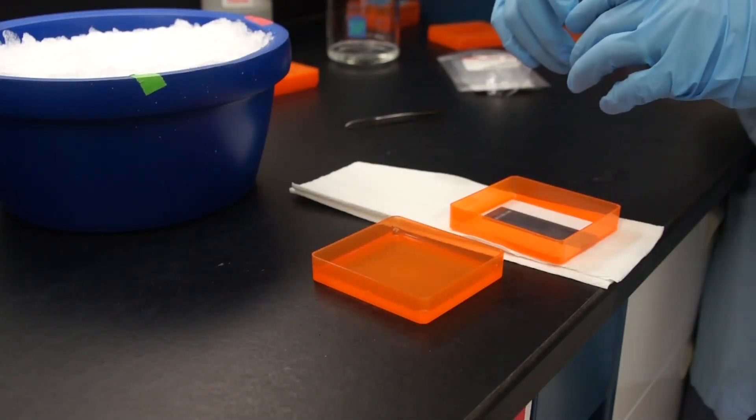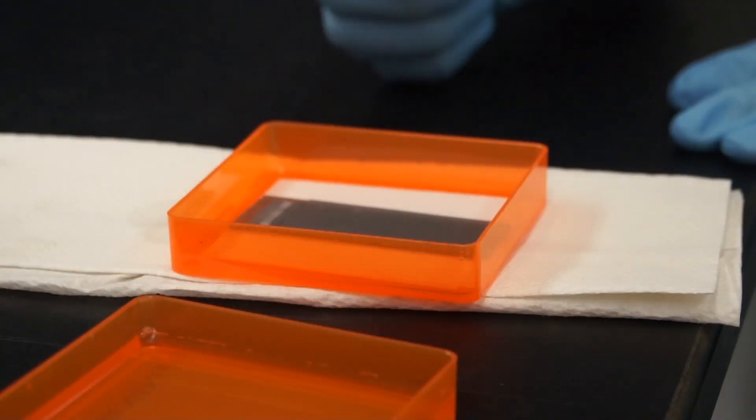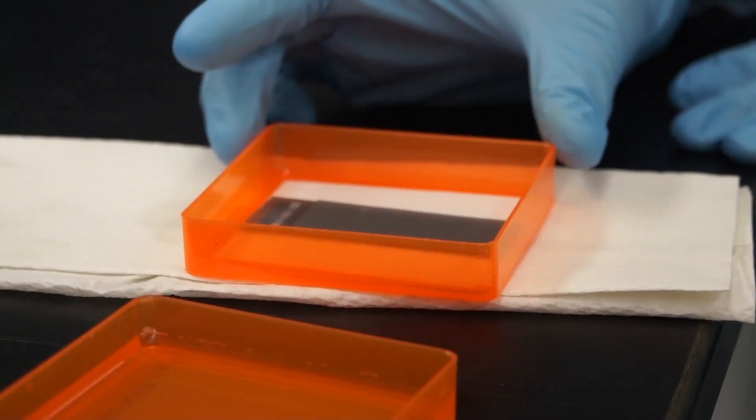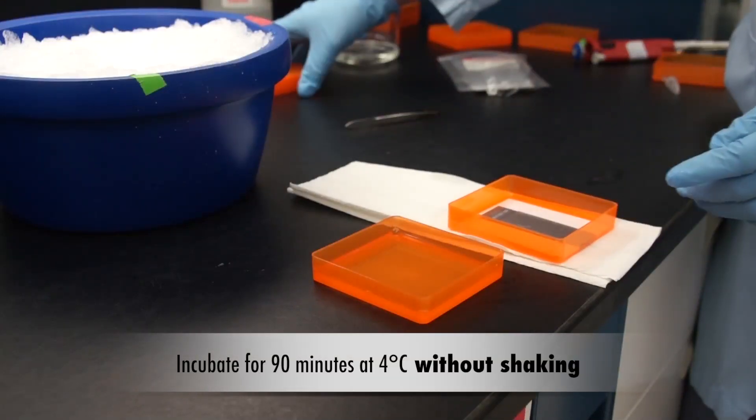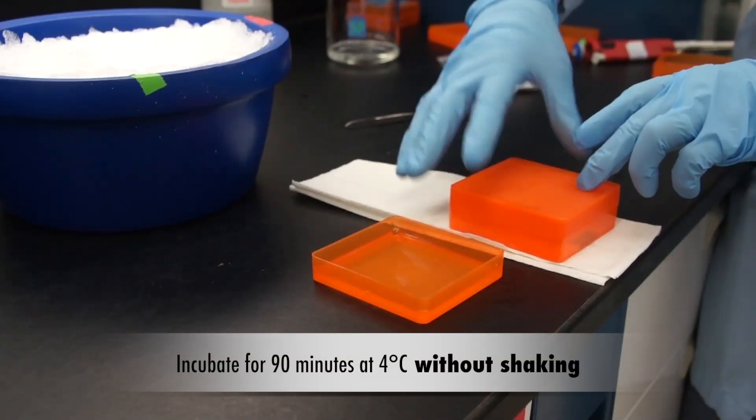Cover the slide with a coverslip like so, and place in an incubation chamber with wetted blotting paper lining the bottom for 90 minutes at 4 degrees Celsius.